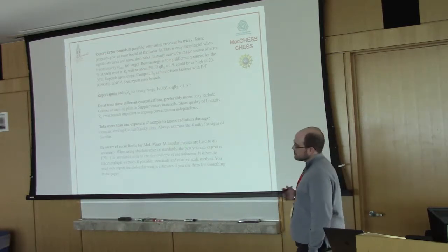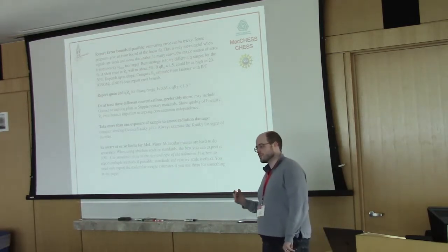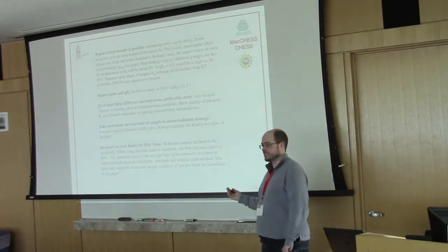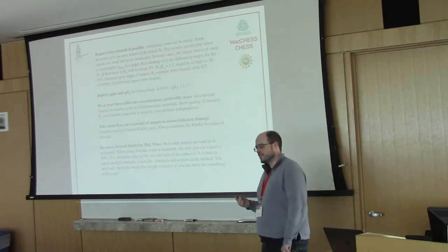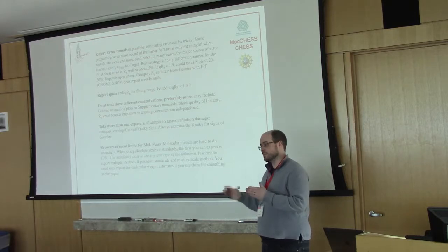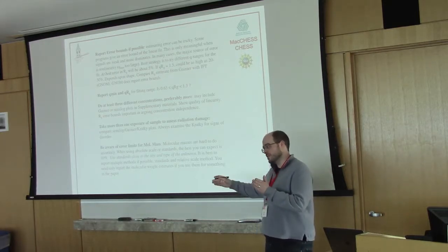The other thing to do, and we do this by default, is you need to have several exposures, right? If you just have one long exposure for 10 seconds instead of 10 1-second exposures, there may be radiation damage hiding in that one exposure. You want to take multiple exposures and make sure one after another is all the same.